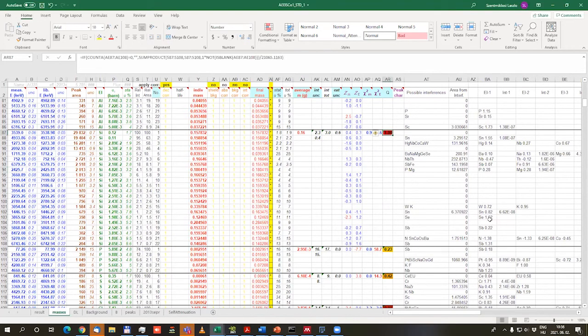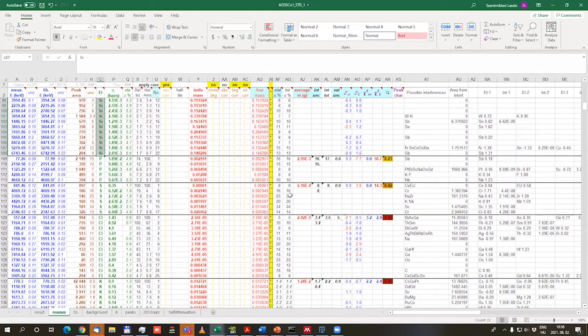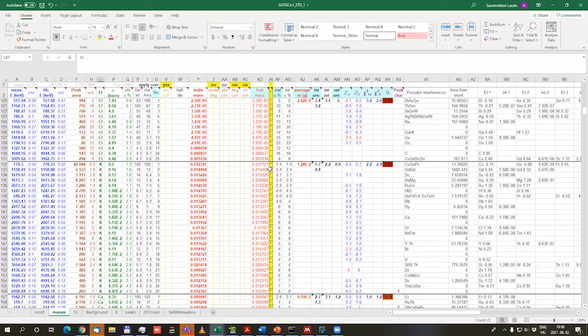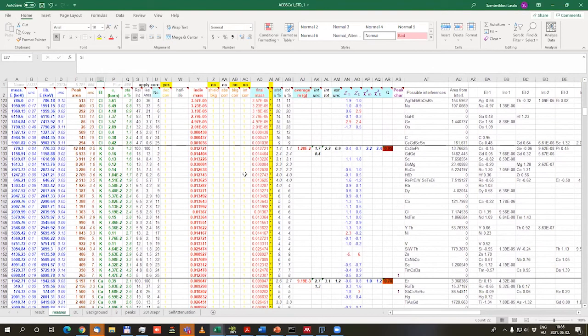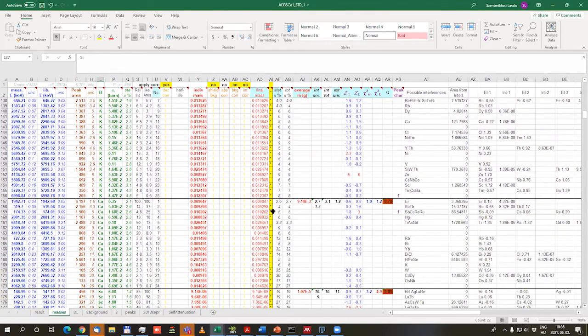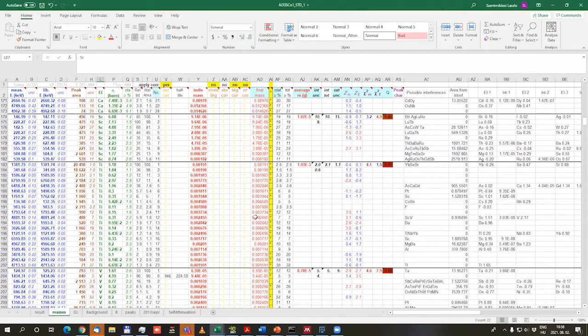And still this quality factor is rather high, so we can be very confident that silicon is present in our sample. And just like in the case of potassium, we have plenty of analytical lines with agreeing masses. The same is true for calcium and for many other elements.